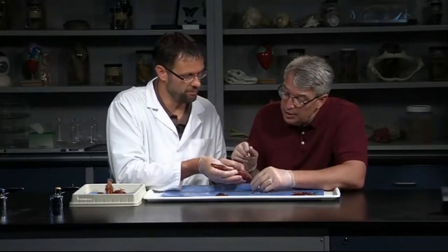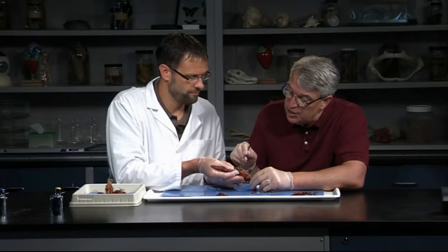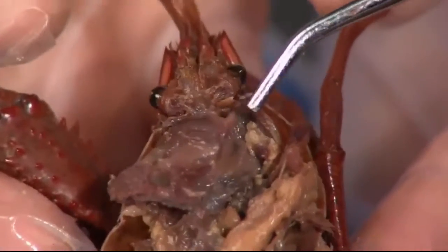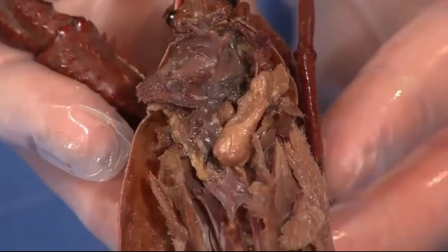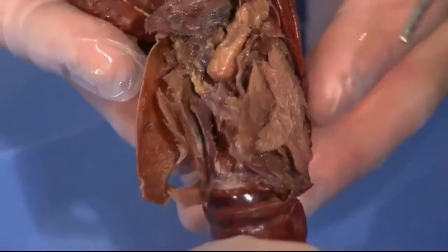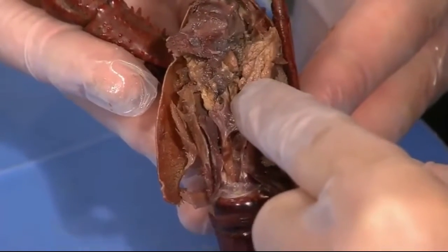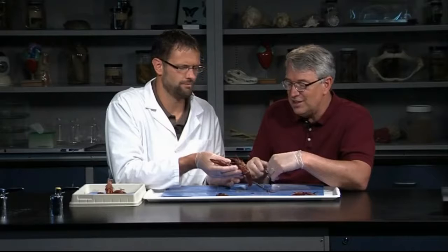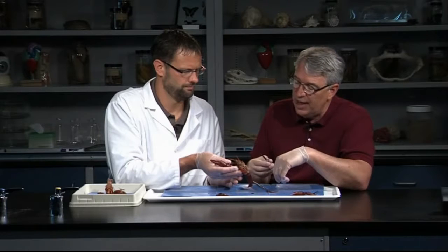So what else are we looking for? Pretty much the heart is part of the circulatory system. The digestive system is complete but fairly short, with a stomach for storing food, some grinding, and digestive glands to help produce enzymes to break down food. Nervous system? The nervous system is hard to see. There's a ventral nerve cord with some ganglia, some swellings in each structure, and we'll probably see a little bit of that.